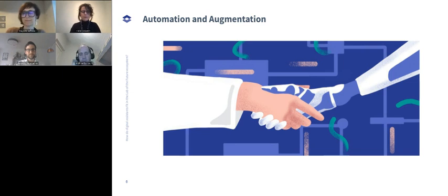But I think one area that you have when you have a lot of automation and the type of laboratory environments that Andreas was describing there is you also need some sort of help for the people who are in those spaces. And that help is not always available directly in person, especially at the moment with the whole pandemic situation. And so, one of the areas that we've been exploring and has been looked at is the use of augmented reality headsets. So the HoloLens, for example, is something that was experimented with to assist a scientist in a laboratory environment. And as part of that, you need to have audio input as well.